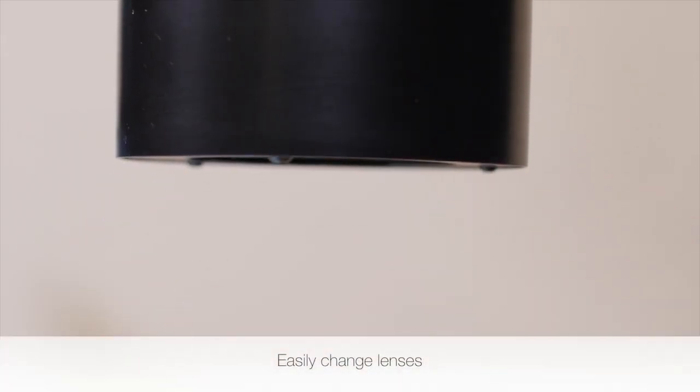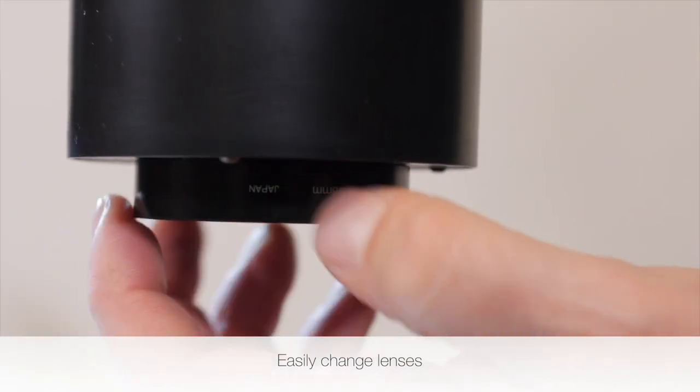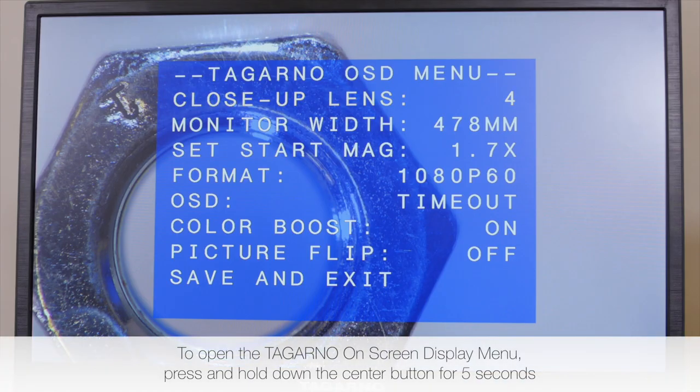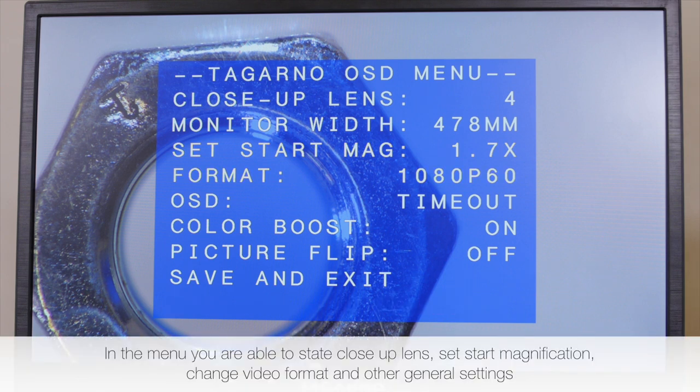Easily change lenses. To open the Tagarno on-screen display menu, press and hold down the center button for 5 seconds. In the menu, you are able to state close-up lens, set start magnification, change video format, and other general settings.